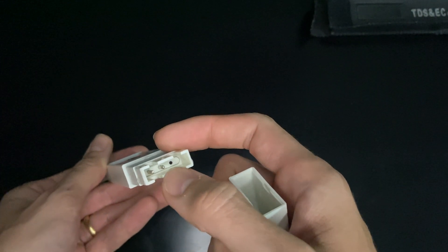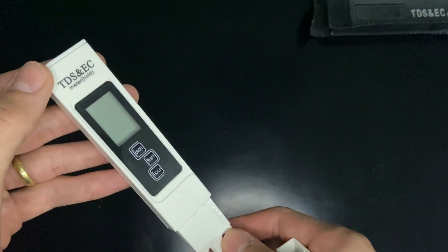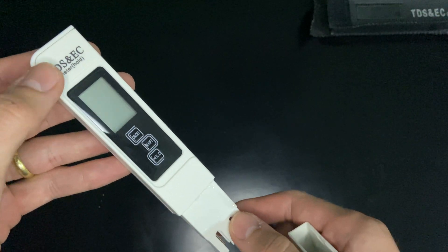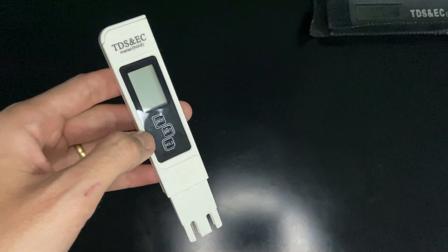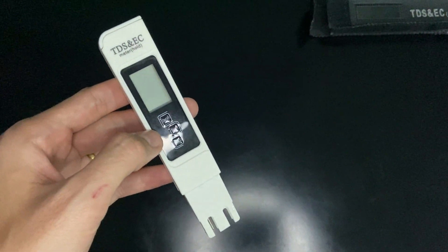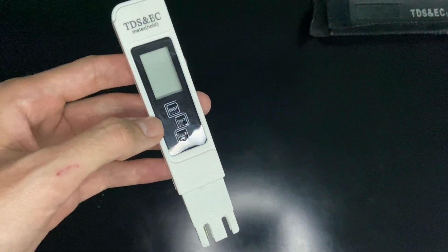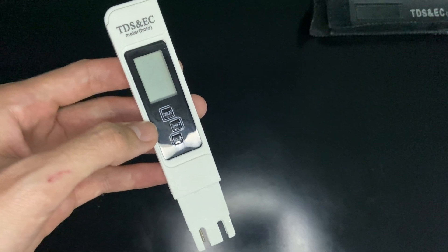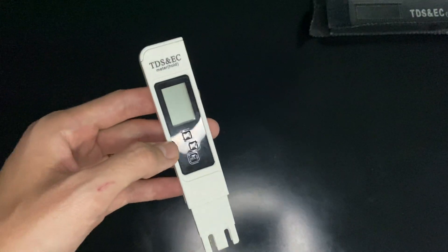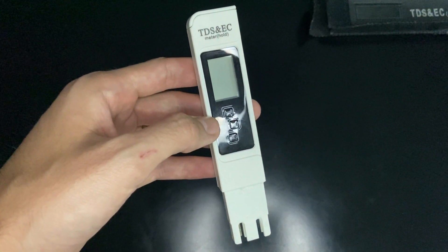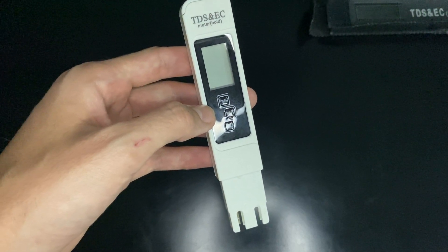It measures the total dissolved solids in the water. What are these solids? They can be ions, cations, anions, mineral salts, metals, organic substances, and inorganic substances as well.